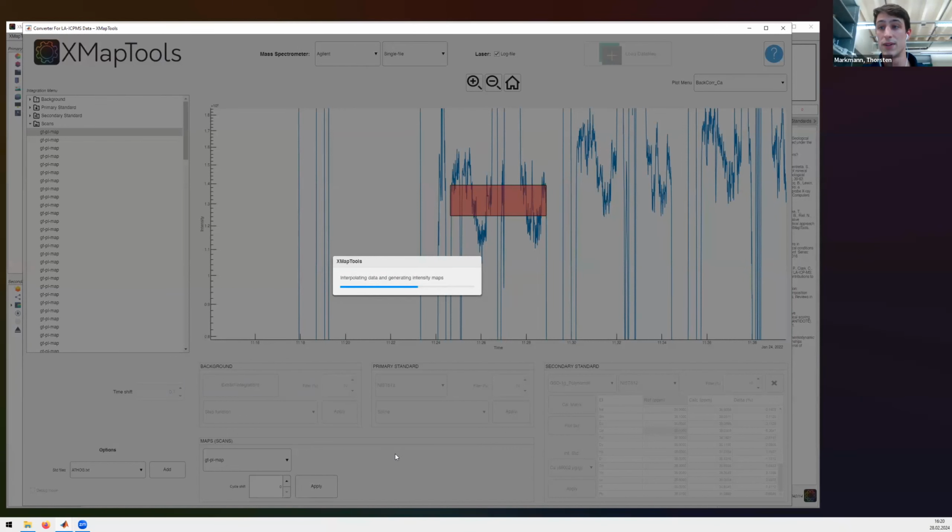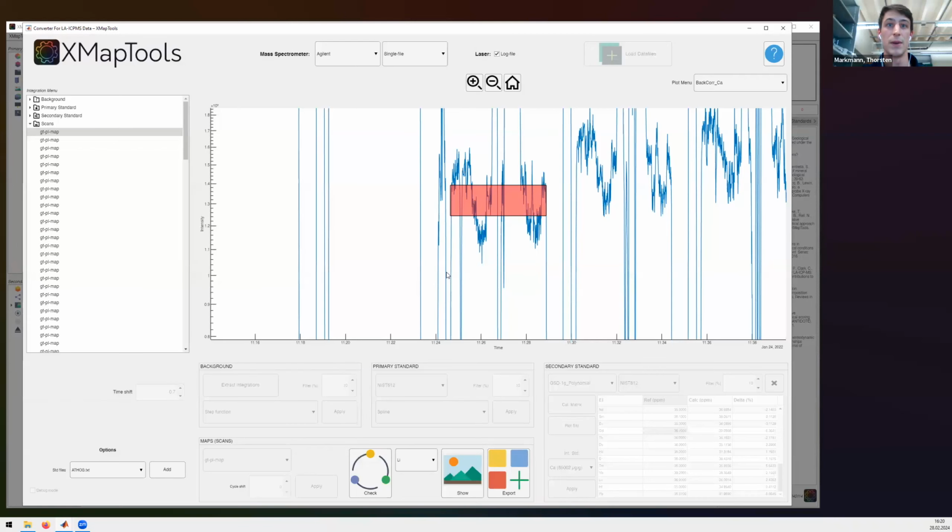It is also saving all the information we want to have from the primary standard for each element. And since we have been saving 4 different primary standards with 38 elements, this can take a minute or so. So in a few seconds, this should be done, and we will be ready to investigate the first results we got from the pixel allocation algorithm.